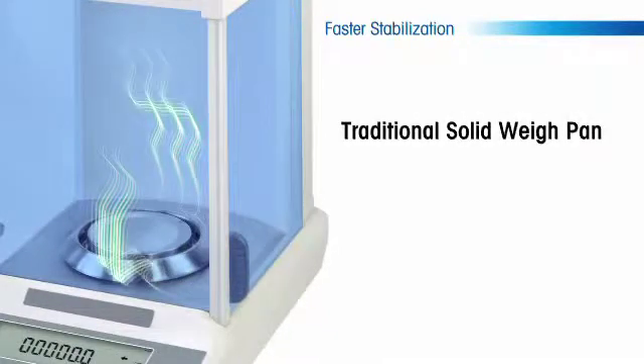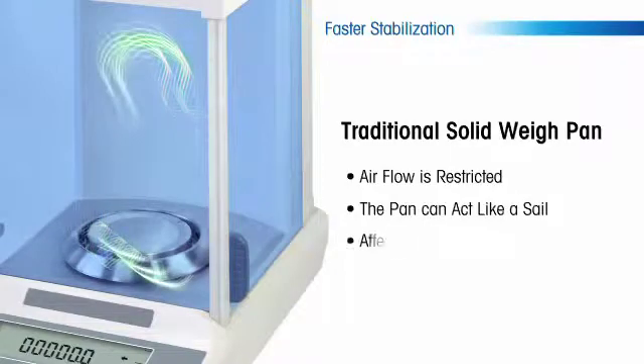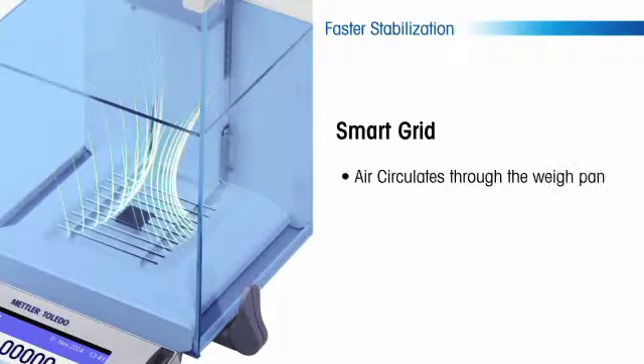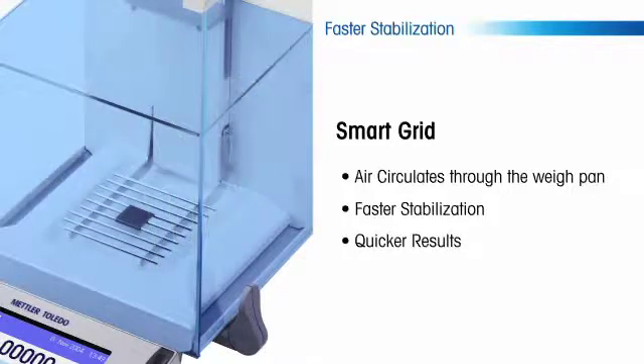With a traditional solid weigh pan, the airflow is restricted and the pan can act like a sail that affects the stabilization time of the balance. The smart grid helps solve this issue as air is allowed to circulate freely through the weigh pan, leading to faster stabilization and quicker results.